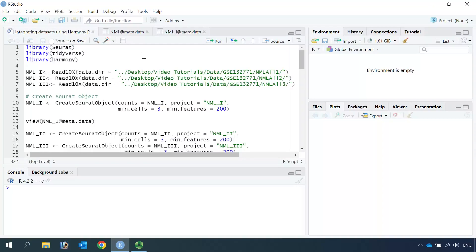In my previous video, I showed you how to use the standard Seurat integration method. Today I'm going to show you how to use Harmony to integrate your dataset. After watching this video, you will realize the Harmony method is quicker and faster, and also very easy to use.